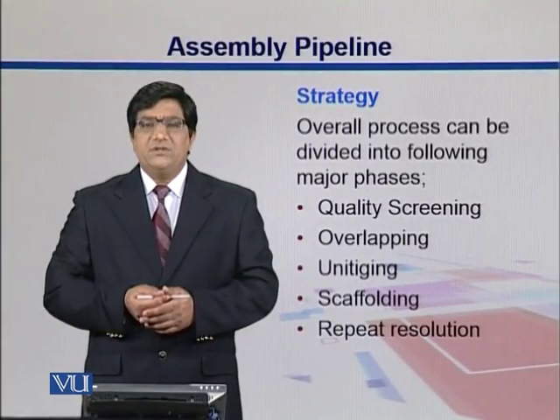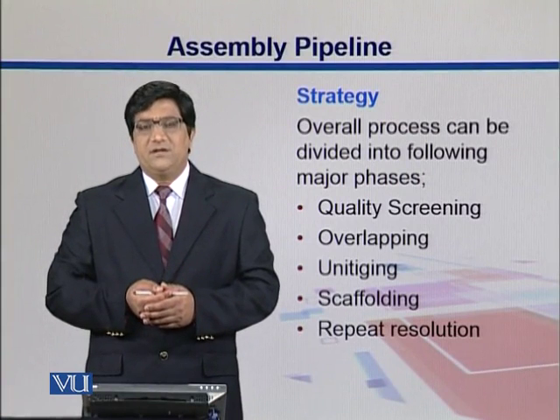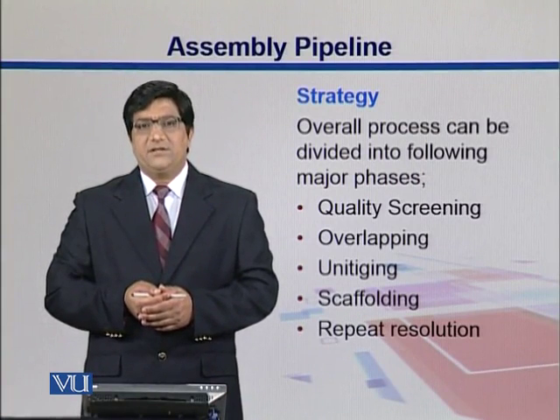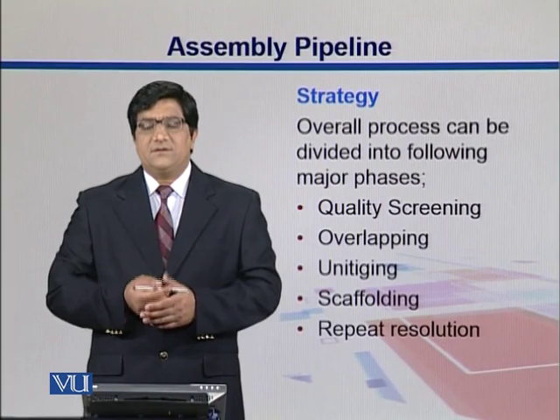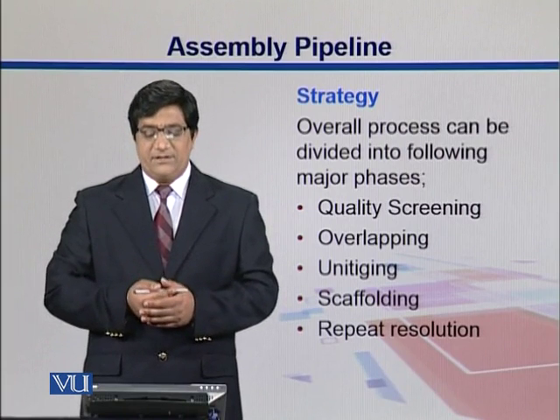So let's look into the pipeline for assembly. Now we are starting with those short reads. We are talking about libraries. We get those reads, and let's look into what we can do on computers. That is what I define as the assembly pipeline.